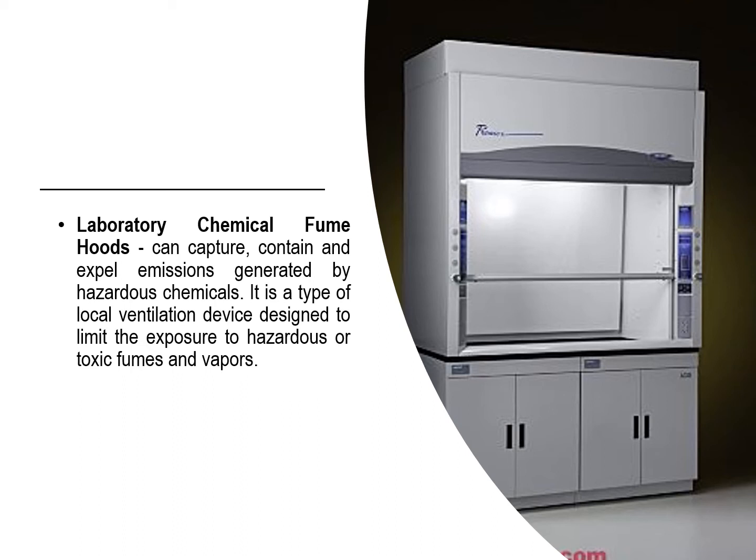This is a type of local ventilation device designed to limit exposure to hazardous or toxic fumes and vapors. So, this is also one way of protecting the person handling the chemical, because there is a barrier in the form of the lid that separates the chemical from the person handling it. If the chemical emits fumes or vapors, the person would be prevented from inhaling them directly because it's processed inside the chemical fume hood.